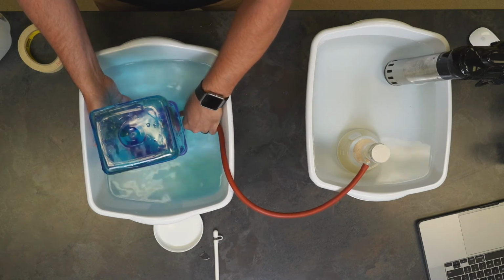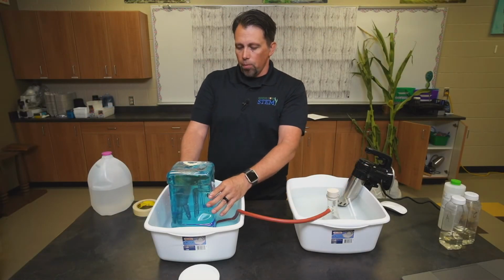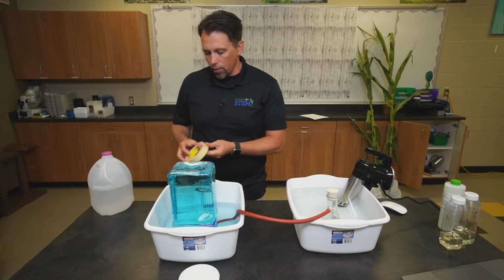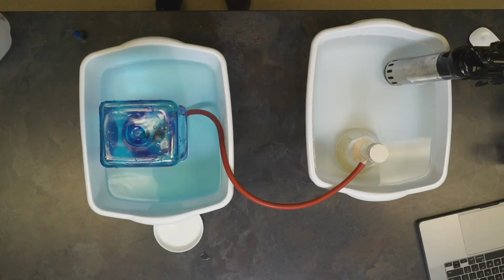So work that in there. You don't need to put it all the way through. It just shouldn't slide out. But we want the bubbles to be trapped inside of this. Then we'll let this set overnight. Watch it throughout the day.